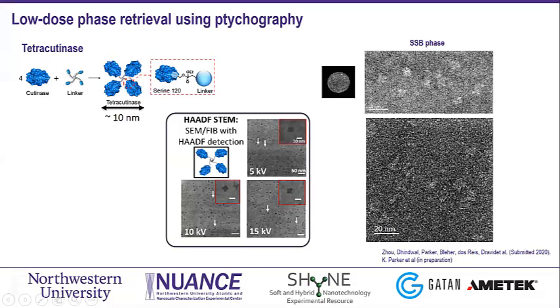On the right side here, I show, like I mentioned, a very fresh example from ptychography reconstruction using diffraction patterns like the one shown here, where you can really see the same structure, right? At least the morphology of that, the characteristic four lobes of the structure, on a sample that was not stained.